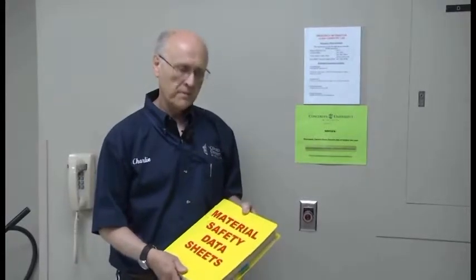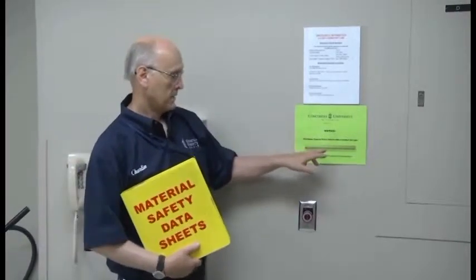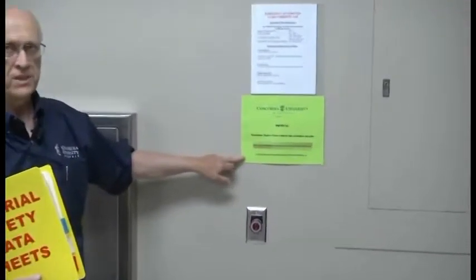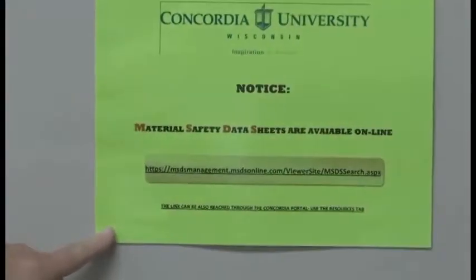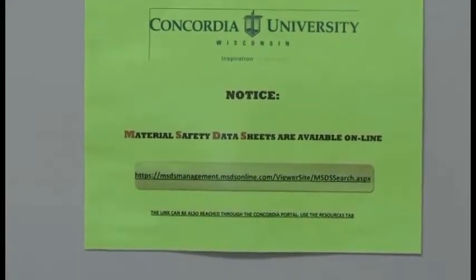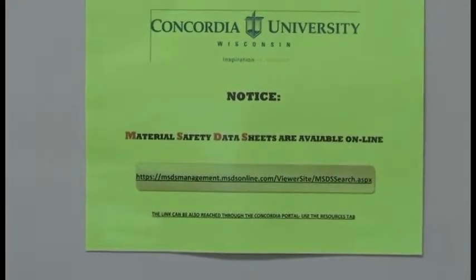But again, in these cases here at the school, it's going to be all of our chemicals we have here. We do use a database for all of our chemicals on campus. You can also find anything that we have on campus online through our MSDS Online, which you will see right here. You go to the portal, go to the resource section. On there you can just type in whatever material you're working with, and that will come up. So all of our chemicals here are inventoried through SysPro, which is a very accurate system of documenting it.